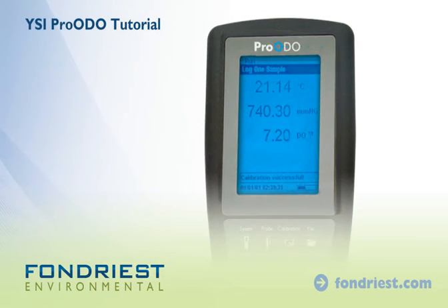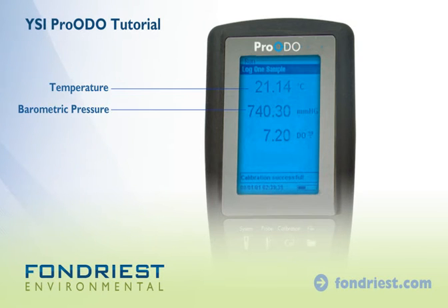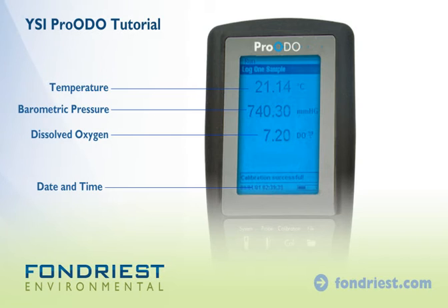By default, the meter will display temperature, barometric pressure, and dissolved oxygen. Date and time are also displayed.